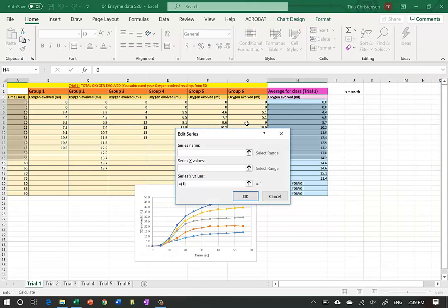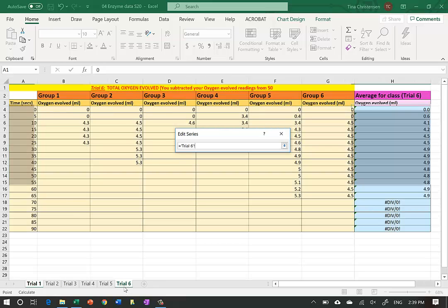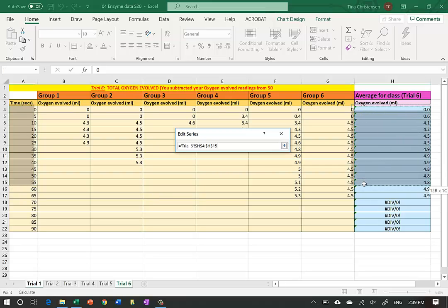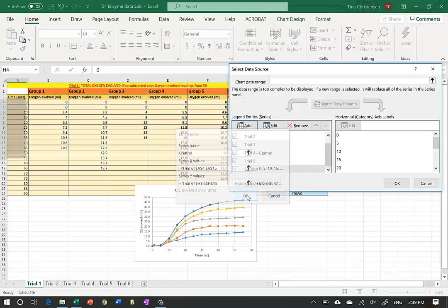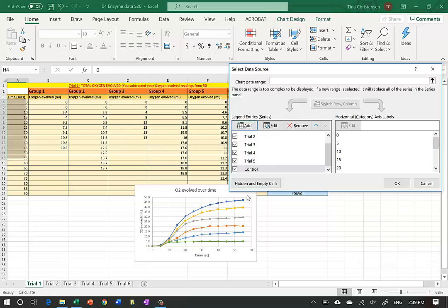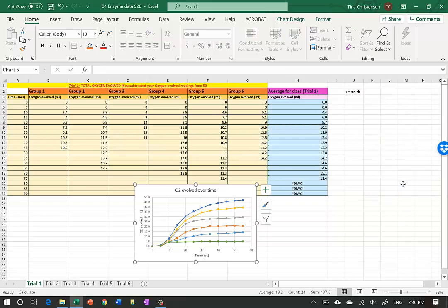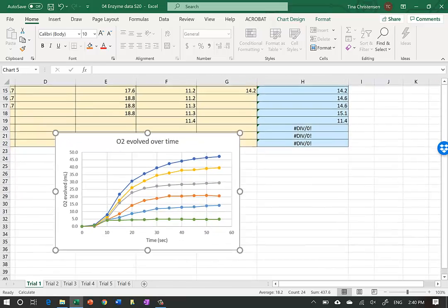The last one to add is the control. I'm going to call it 'Control' rather than Trial 6. I select the data from zero to 55 seconds, then select the last column for Trial 6 from zero to 55, and hit OK. The control ends up very low in green. Now I can zoom in to see it better.